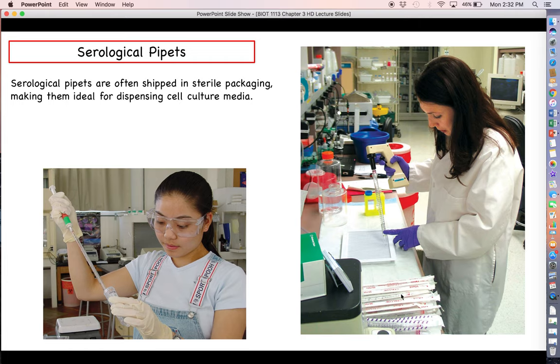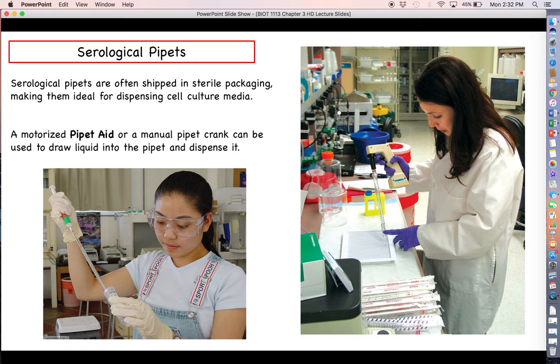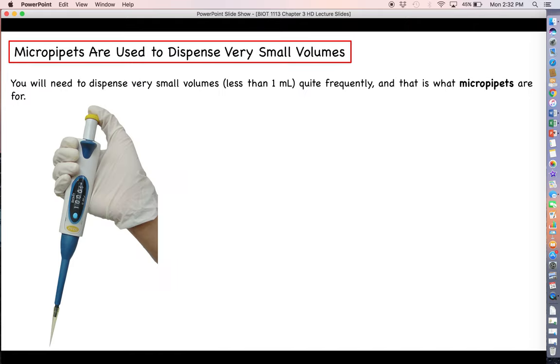Serological pipettes are often shipped in sterile packaging, which makes them ideal for dispensing cell culture media — you want to take precautions to prevent contamination with bacteria or fungus. To dispense volumes using serological pipettes, you can use a motorized pipette aid or a manual crank to draw liquid in and dispense it. My personal preference is the motorized pipette aid, though those have to be charged.